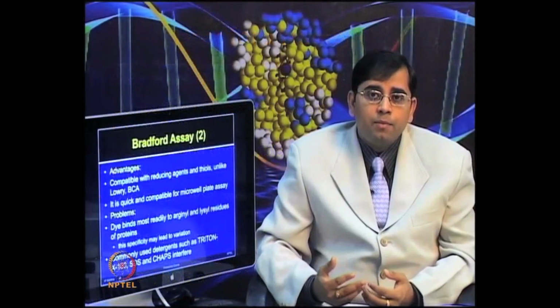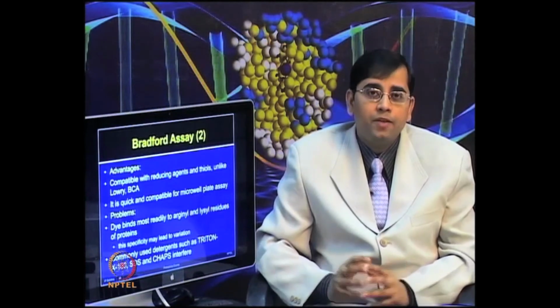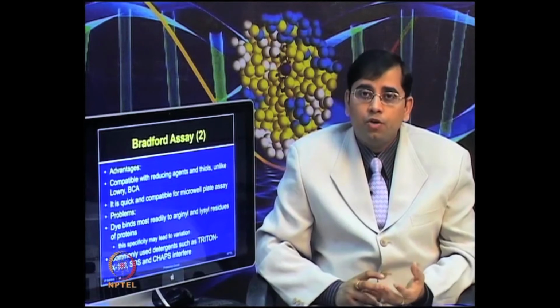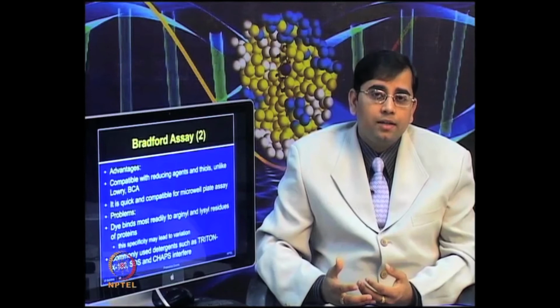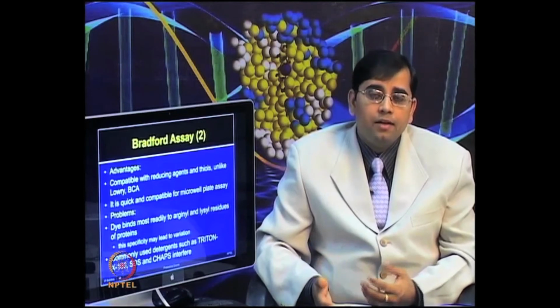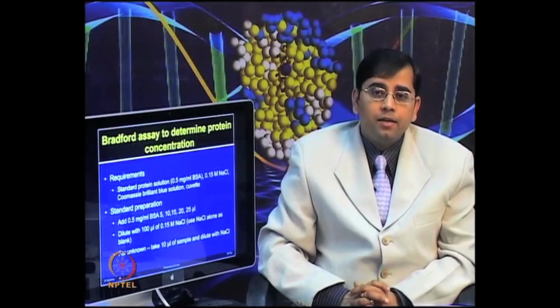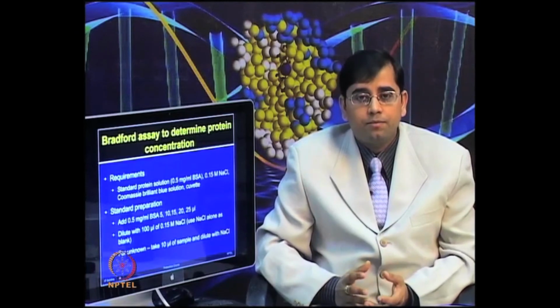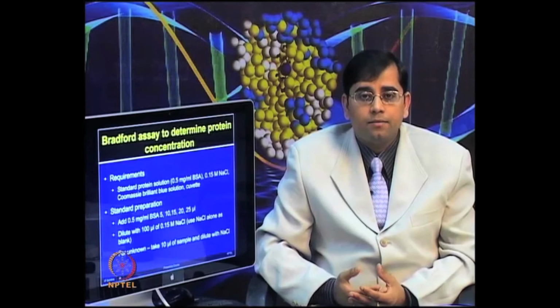So, researchers have come up with various types of modified Bradford assays for specific applications. Again, you have to keep an eye on the components of your buffer, and you need to ensure that it is compatible with the assay conditions or not. So, let us talk about the Bradford assay in a little bit more detail, so that one can use that to determine protein concentration.